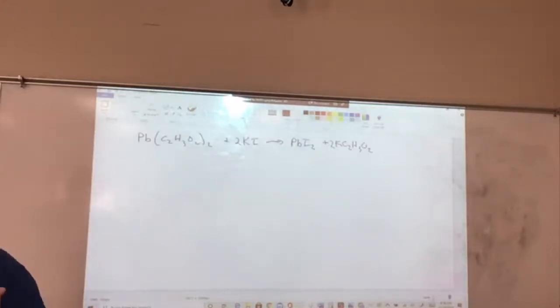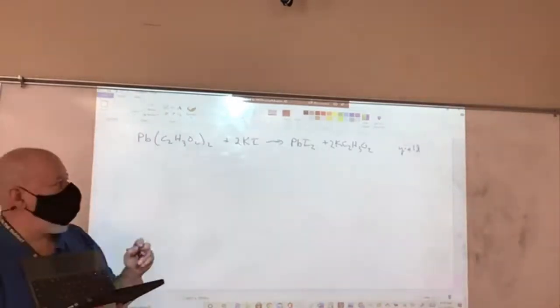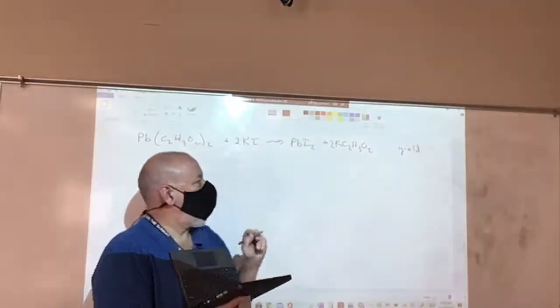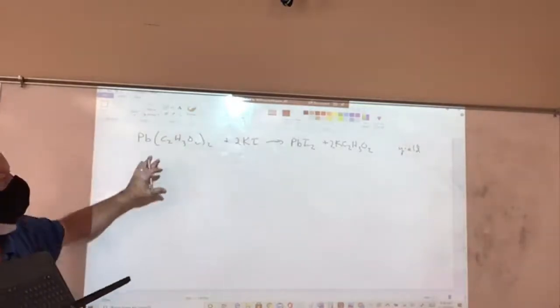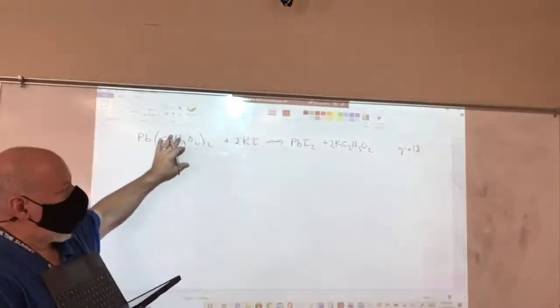If I got 70% of the stuff that I'm supposed to get, I have a 70% what? What might be a term that would describe a 70%? Think of business terms. I want to say income, but that's probably not right. How about yield? I have a 70% yield. If I get 70% of what I'm supposed to get, I would have a 70% yield. So we're going to use this idea of yield to say, this is my goal.